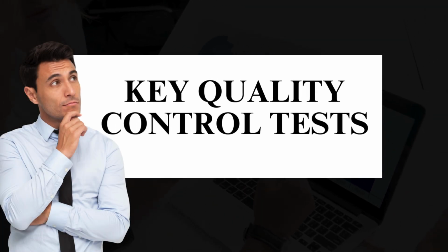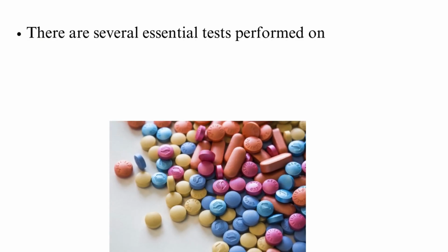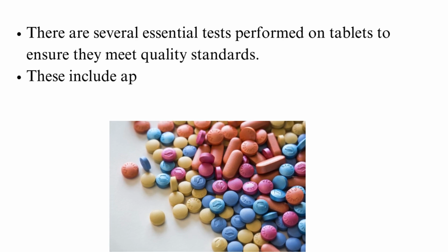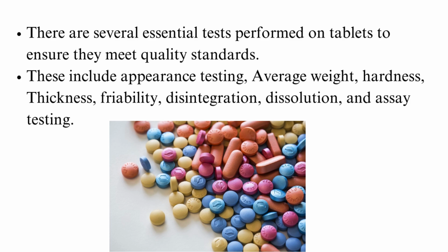Key quality control tests. There are several essential tests performed on tablets to ensure they meet quality standards. These include appearance testing, average weight, hardness, thickness, friability, disintegration, dissolution, and assay testing. Let's break these down one by one.